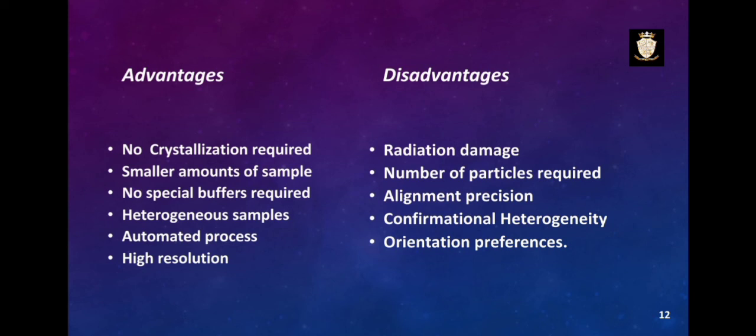Then the disadvantages: the radiation may damage the cells of the specimen, the number of particles required, the alignment precision, and also the conformational heterogeneity and orientation preference are the disadvantages of single particle reconstruction.